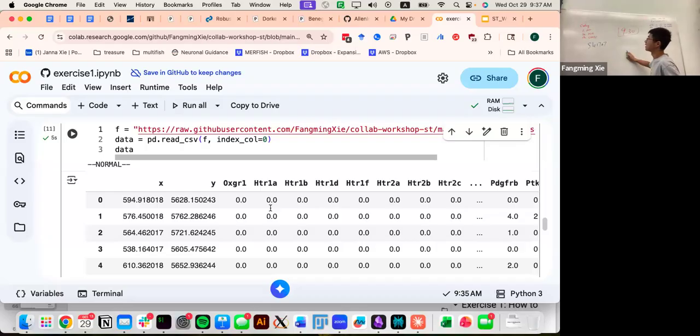Let's do it. For the next 10 minutes or so, you can play with it yourself, and maybe you can spend another 5 minutes talking to your neighbors and see where you're stuck, or just learn from each other. After that, we'll do it all together and address your questions. And I will be going around. If you have specific questions, I can help you. Okay.